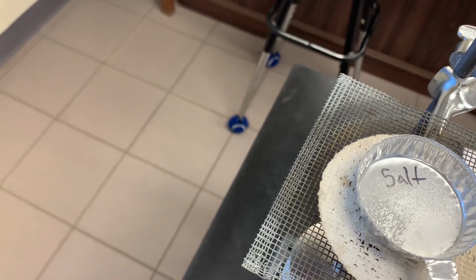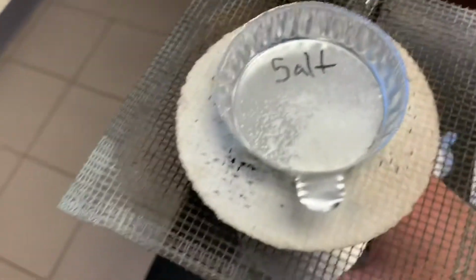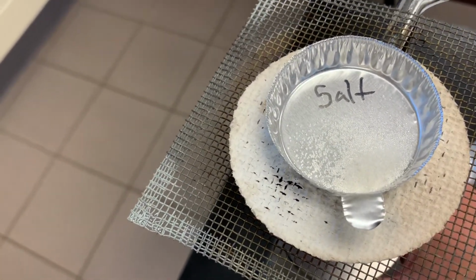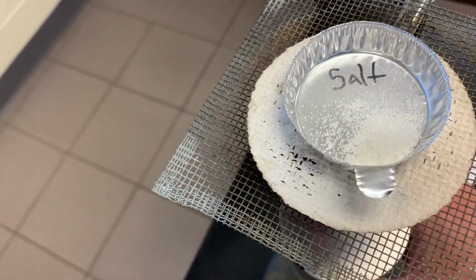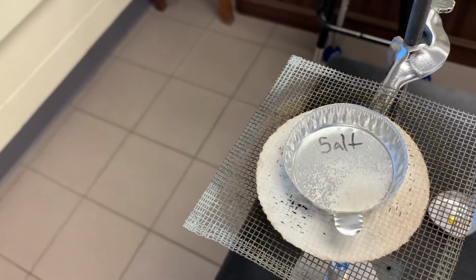Maybe, well, if you look closely, you can actually see the salt bouncing around. It's getting enough energy that it's bouncing around, but it's still not melting yet, even though we increased the temperature quite a bit. Anyhow, enjoy. Hope you're having fun.